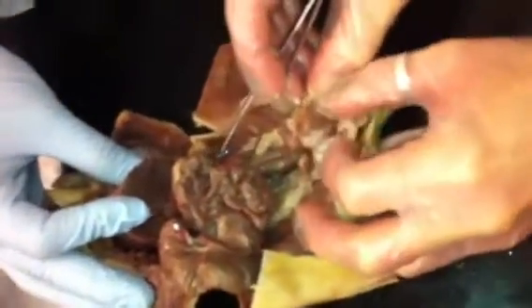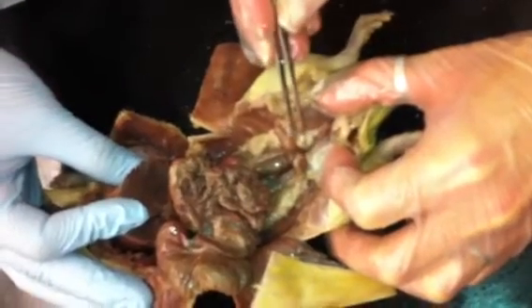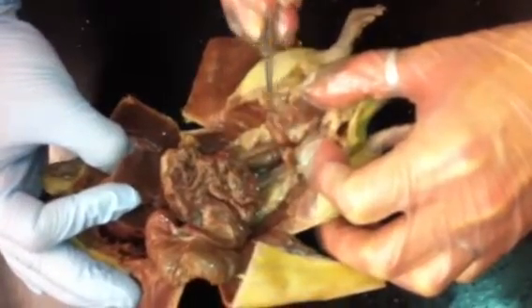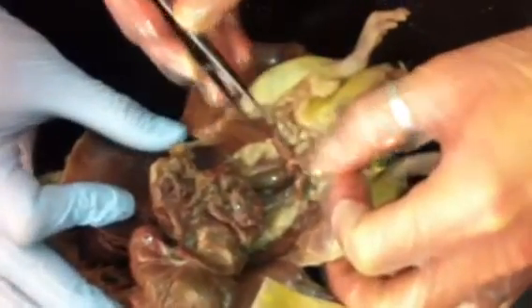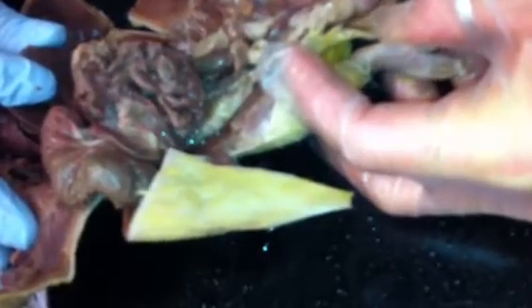And then the prostate gland is supposed to be below the bladder. So I believe, see, it's a little bit different in color, and it looks like an even smaller bean. That's the prostate on one side, and there should be, yeah, I can see them better today. There's the other prostate gland right there. And then here, moving into the scrotum, do you see this long tube? That's the vas deferens. So it's going to transport the sperm from the testes up into the urethra so that the male can transfer sperm to the female.